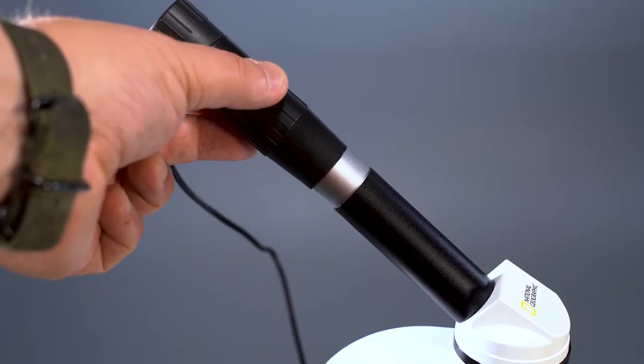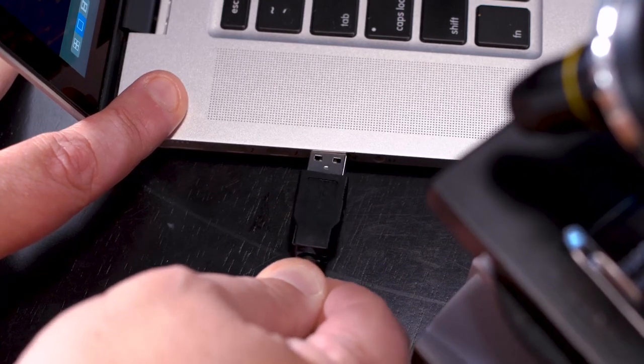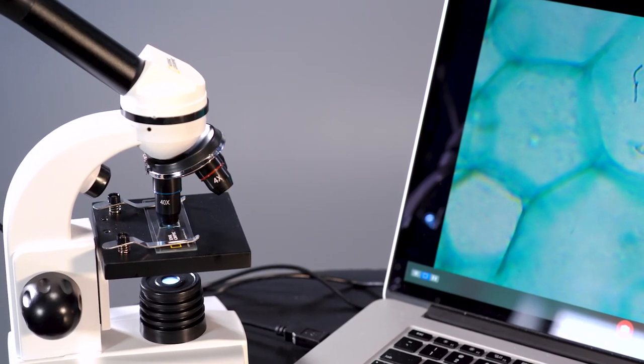The easy-to-use USB eyepiece is compatible with Windows 10 and Apple. Plug the eyepiece into any USB port, then open the Camera app in Windows or Photo Booth on an Apple computer.